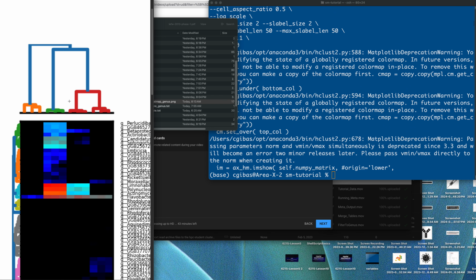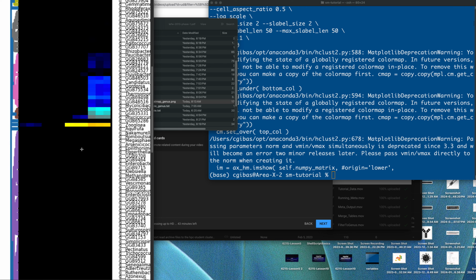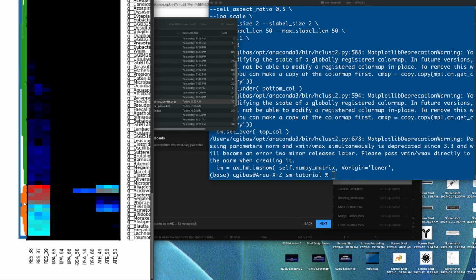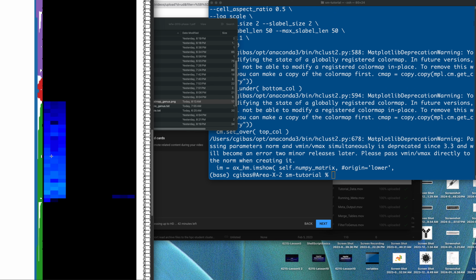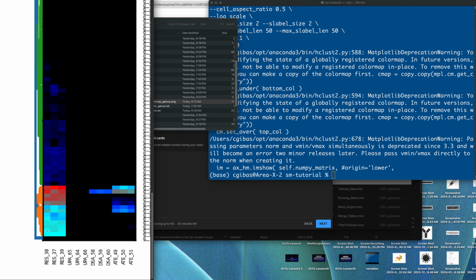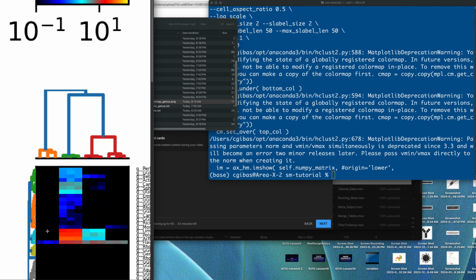We can see that in the dendrogram as well. The downstream sites and the aeration tank effluent sites, which are related to each other, are coming out closest together. The residential sewage is its own whole thing here, isolated from everything else that's influent.